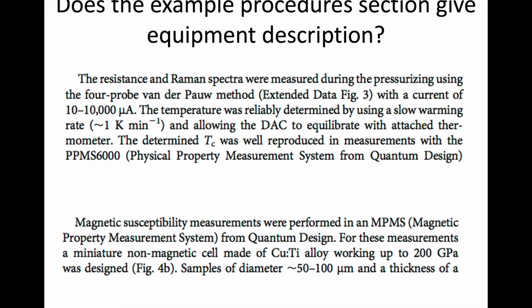If it's smaller stuff like calipers that tend to get used in everything, then there's obviously some leniency, because there's a generic plethora of different calipers that give you more or less the same results.